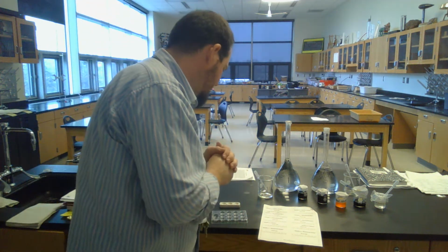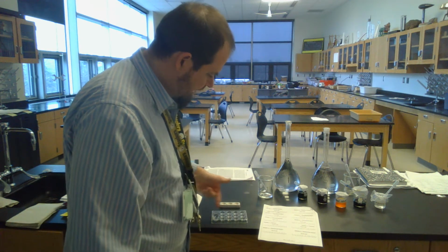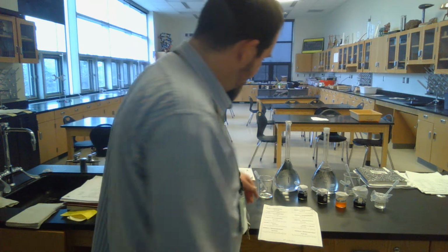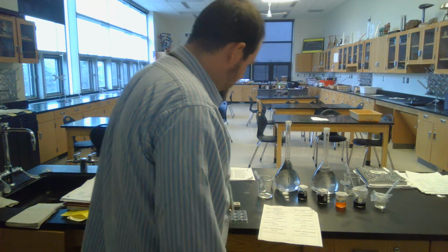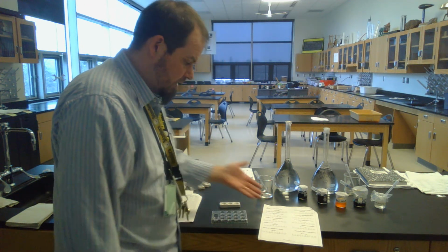Okay, so this is what I want you to do. I got like 4 drops, 5 drops of each in one row here and 1 here, and I'm just going to go ahead and let's do methyl orange first. And I'm going to put methyl orange in there. You can put them in order if you want. You can do them all and then write your data.